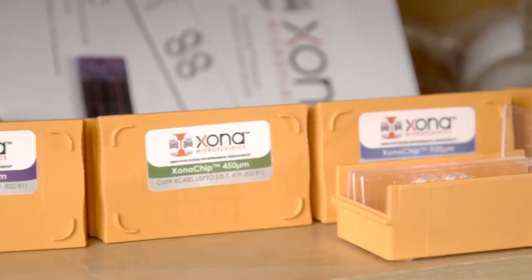Dr. Ann Taylor's lab published a video on the Journal of Visualized Experiments, JoVE — it's a video journal article that actually goes over in detail how to use the XonaChip for culturing with primary neurons.